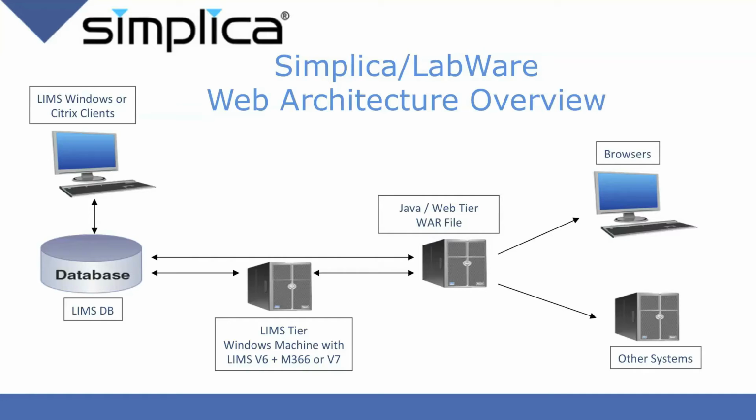Sample Wizard is optimized for performance and generally performs read-only operations directly with the database and write operations using the Labware API. Sample Wizard, of course, runs on browsers as shown here, but we can also configure it to do web service style interfacing to other systems if necessary.